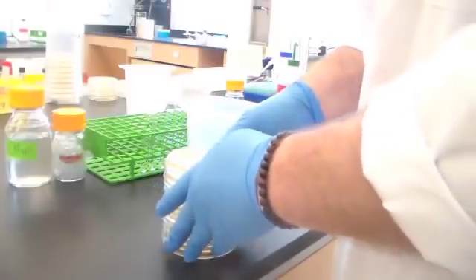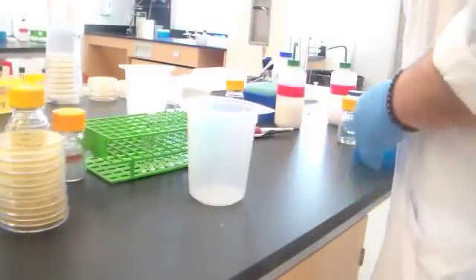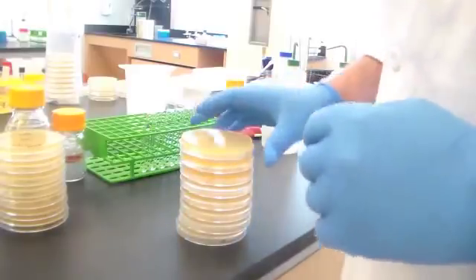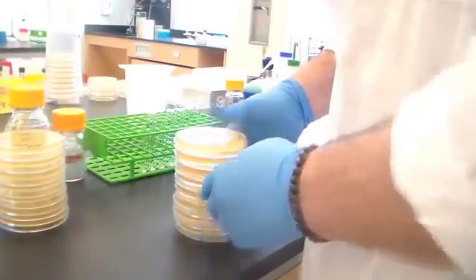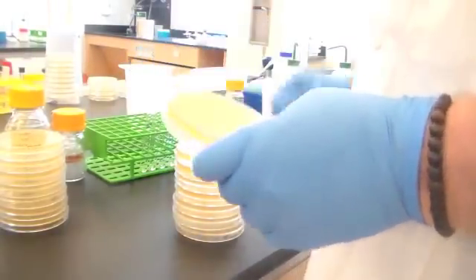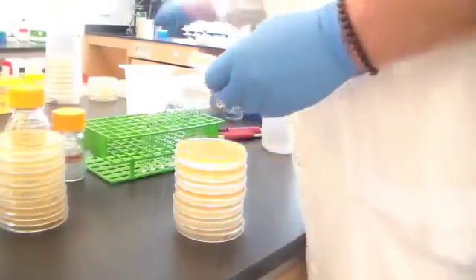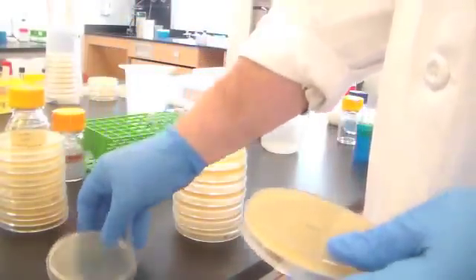Okay, so that is a completed dilution series. Those will go in the incubator to go overnight. Now, like every good cooking show, I went ahead and yesterday I titered out a culture and diluted it out to 10 to the minus 8. So these are E. coli plates, same type of plates, tryptic soy agar plates. Let me first show you what the uninoculated plate looks like. You know what those look like.